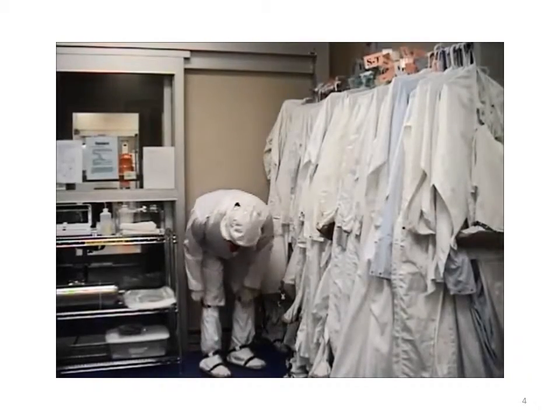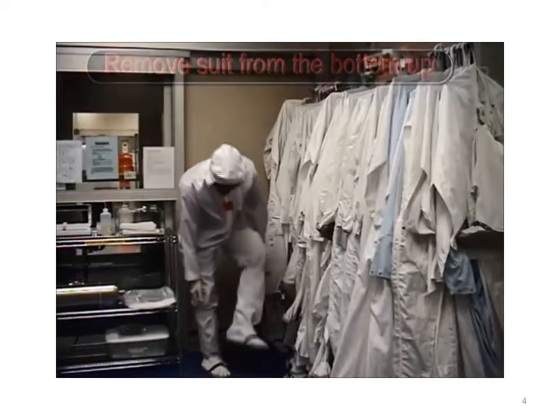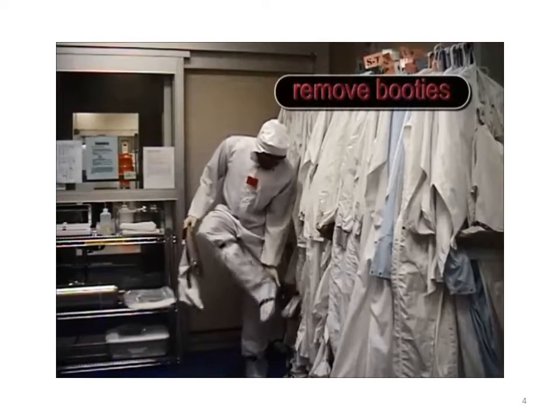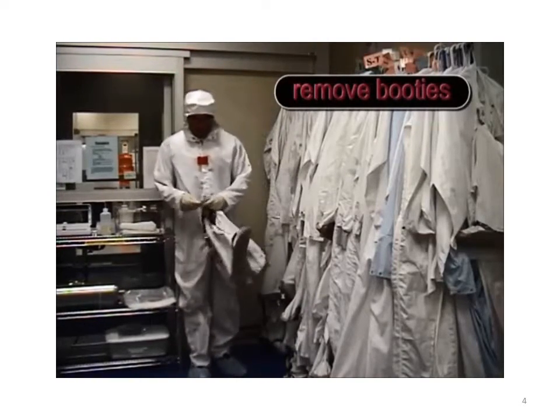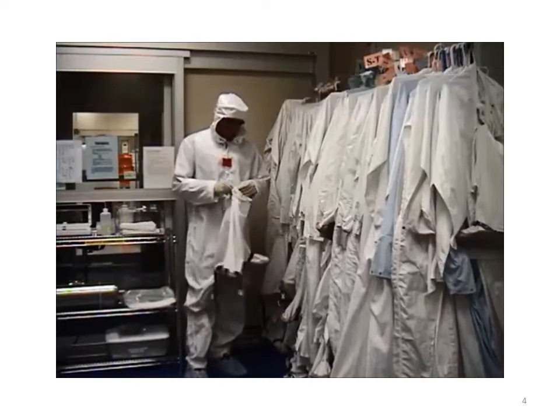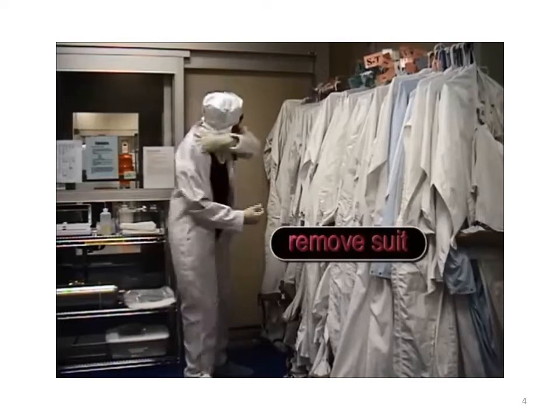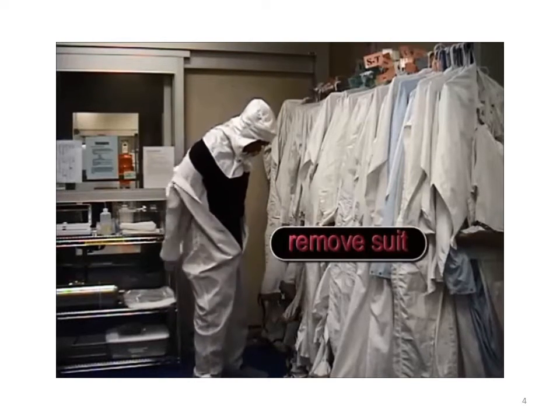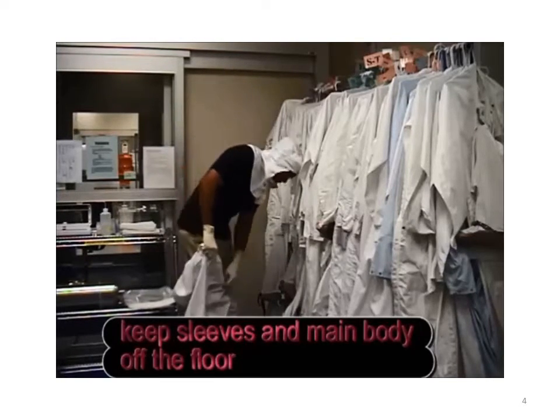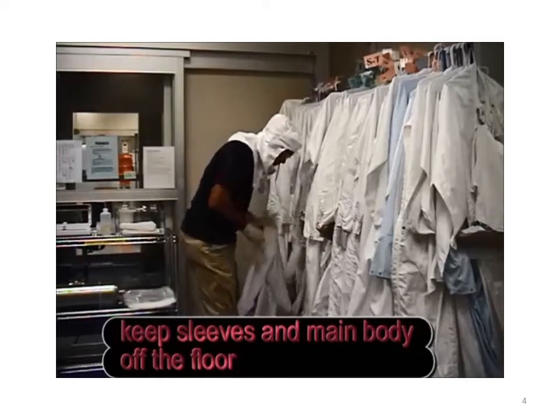In the gowning room, remove your bunny suit from the bottom up in reverse order. First, remove your booties. Next, remove your suit. Keep the sleeves and the main body as much as you can off the floor.